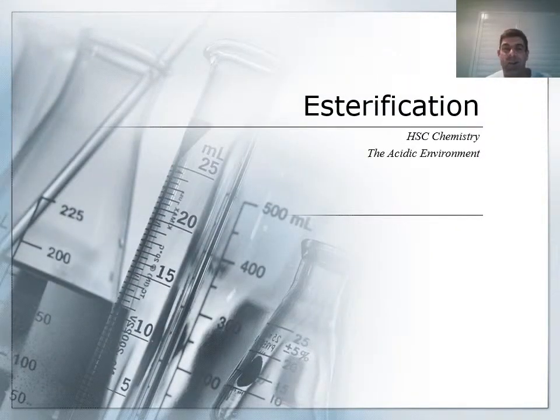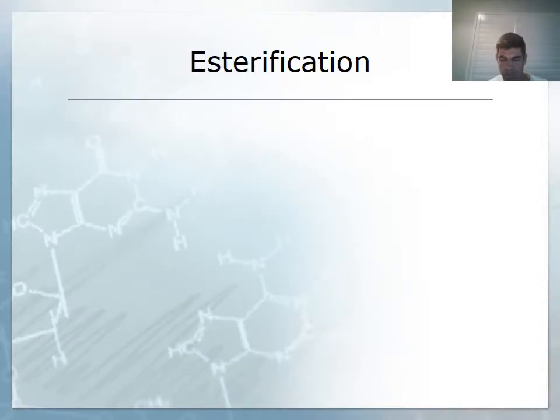Hi guys, and welcome to the video on esterification. In this video I want to have a little bit of a look at the process of esterification, the one that you've carried out now in the laboratory, and also to have a look at the procedure in terms of refluxing and why that procedure is necessary.